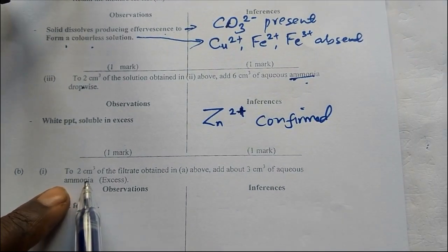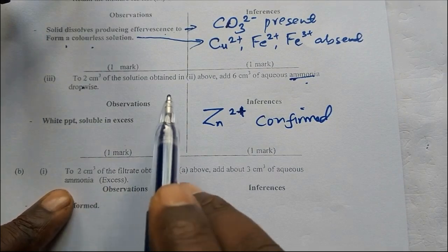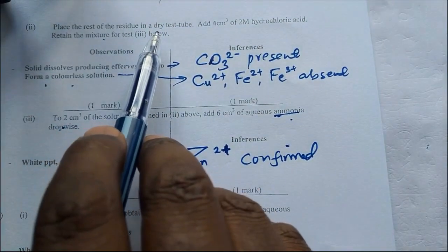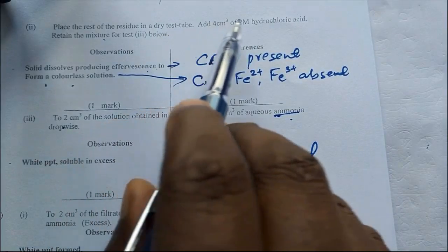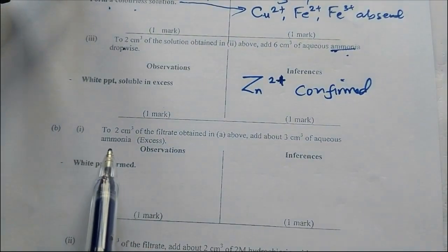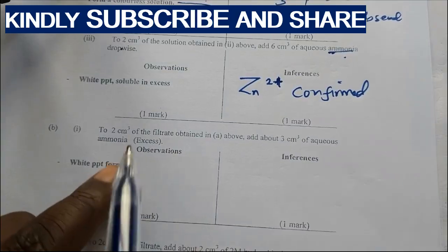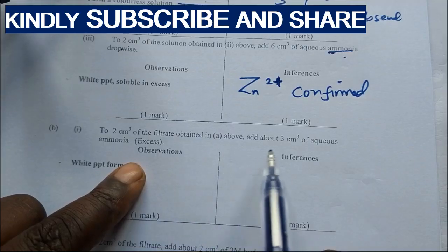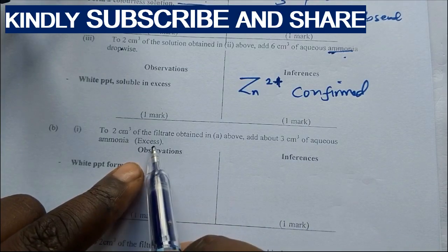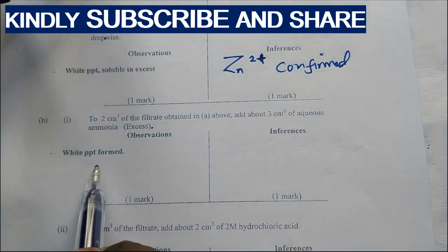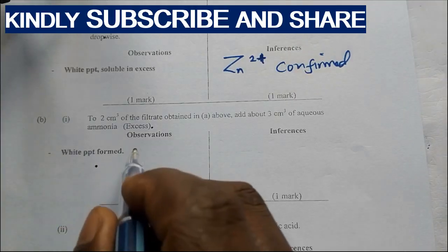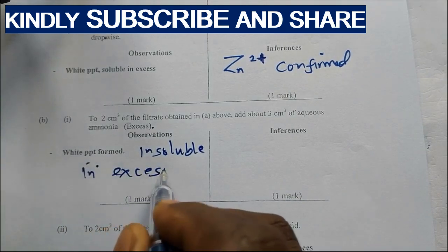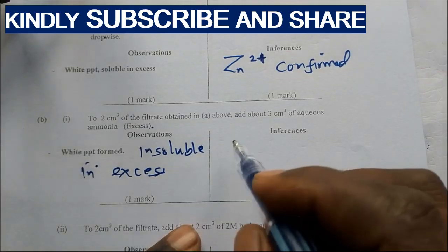To 2 cm³ of the filtrate, remember now we were using the solution from the reaction of the residue with the acid. Now there is a solution we had, the filtrate of the solid. To the second portion of the filtrate obtained in Roman 2 above, add about 3 cm³ of aqueous ammonia in excess. A white precipitate is formed, which does not dissolve, insoluble in excess.